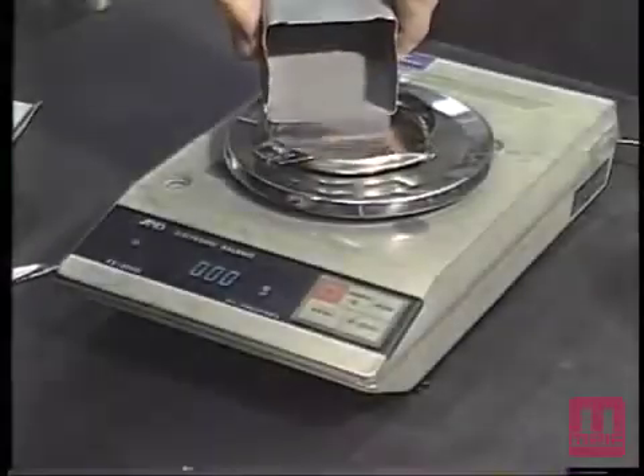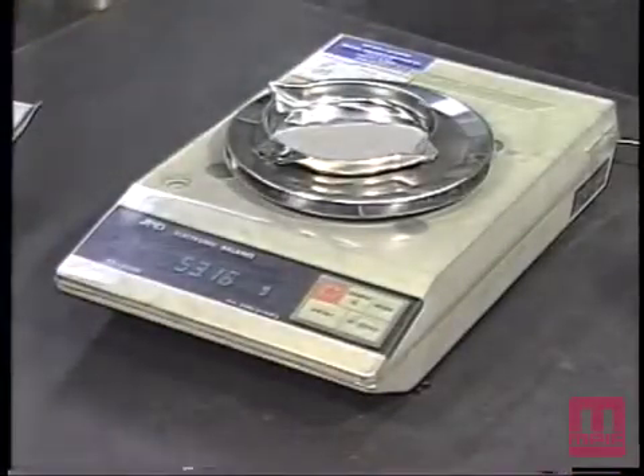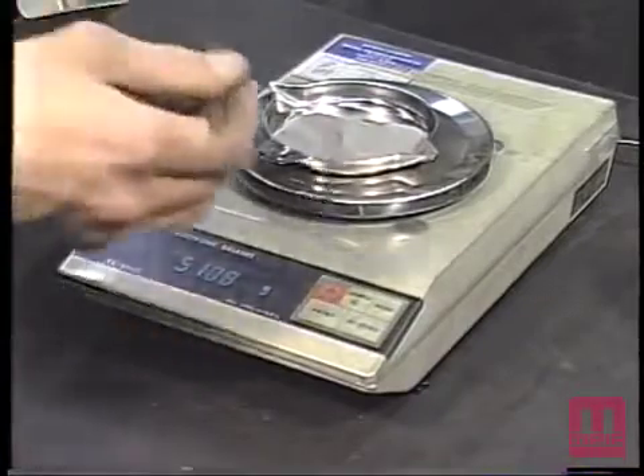The test specimen shall consist of a mass of 50 plus or minus 0.1 grams of metal powder, obtained in accordance with MPIF standard 01, sampling finished lots of metal powders.